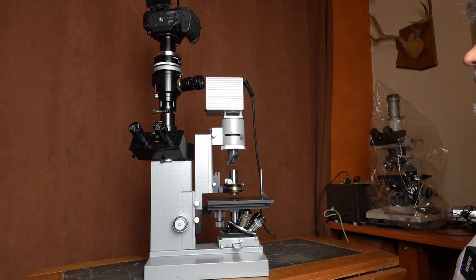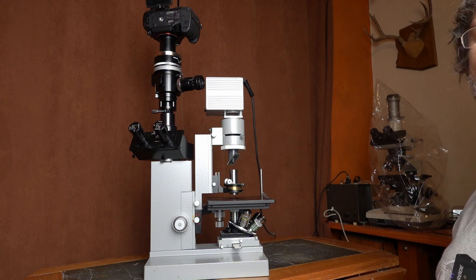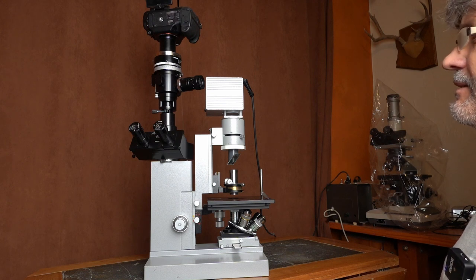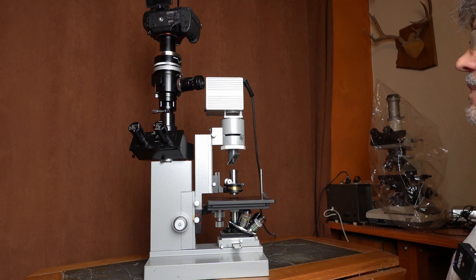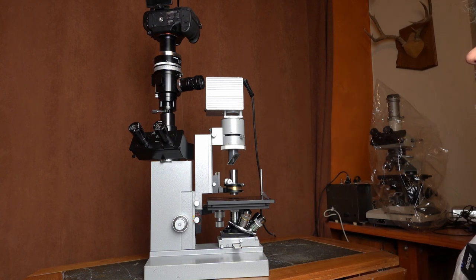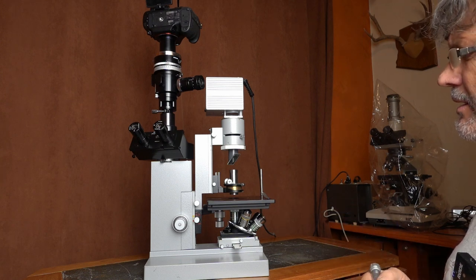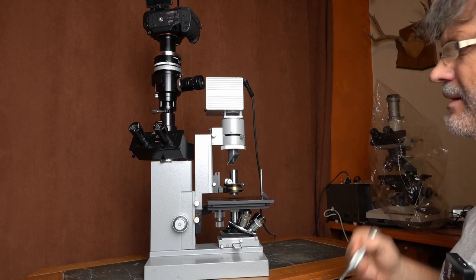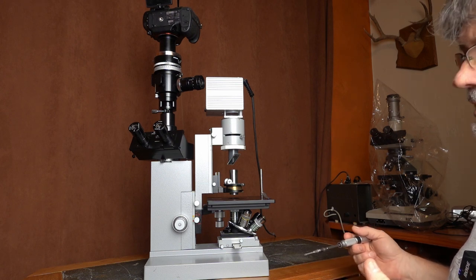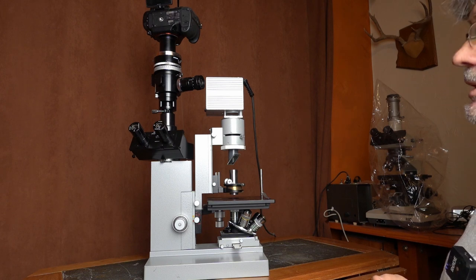This video is about my Leitz Diavert microscope, built in the 1970s. I've been using this microscope for probably the last 20-25 years, hundreds of hours of eyepiece time, mostly looking at pond water in phase contrast. I thought it would be helpful for people new to the hobby to see one of these from this era with some discussion. This is indicative of the era — it's extremely well built and a wonderful microscope.